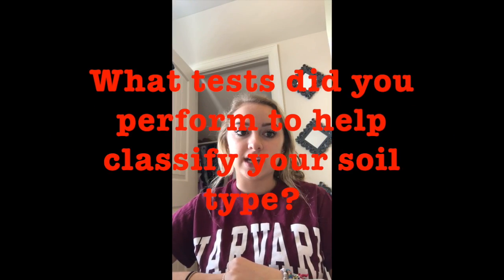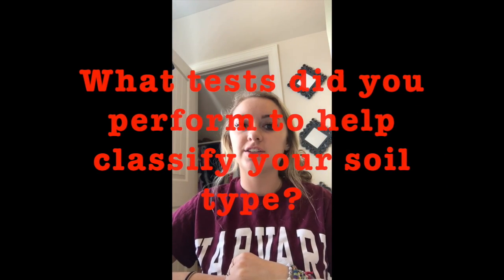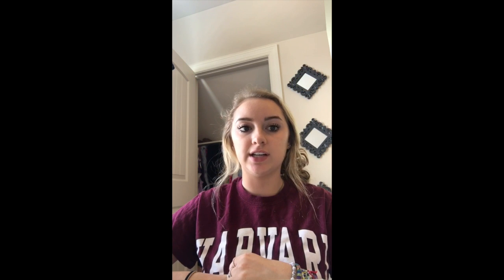To classify our soil type, we use our knowledge of the soil triangle. After figuring out what percentage of sand, silt, and clay were in our jar, we could then refer back to the soil triangle and determine that our soil type was silt loam.